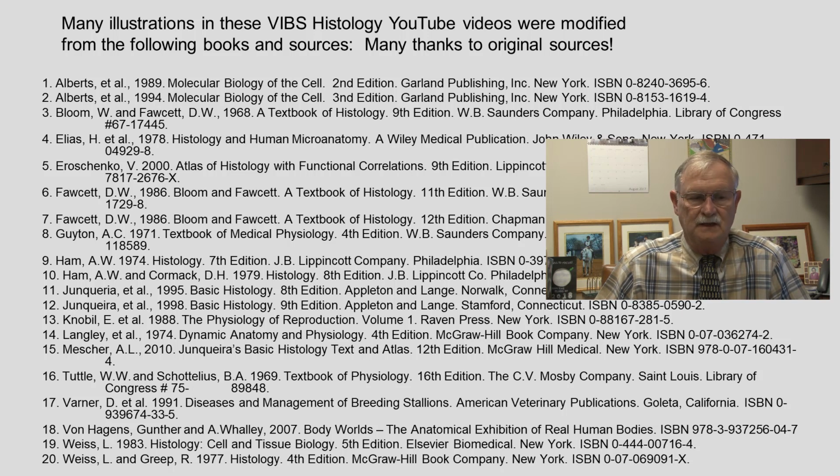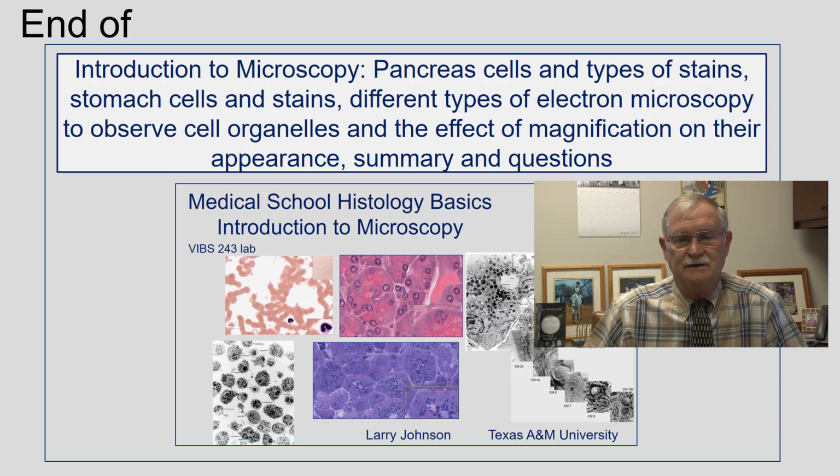Thank you. So that's the end of our introduction to microscopy, pancreatic cells, types of stains and cells in the stomach, different types of microscopy, different magnifications as organelles look at different magnifications, summary, and the one question. Thank you.